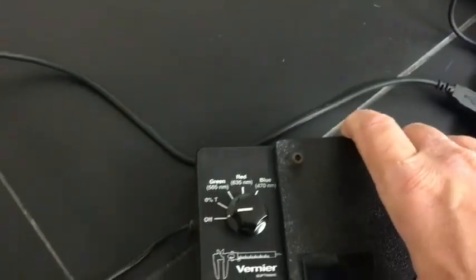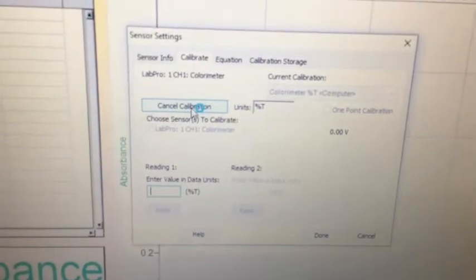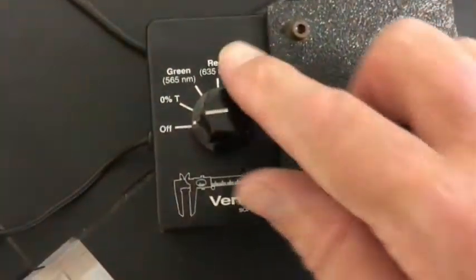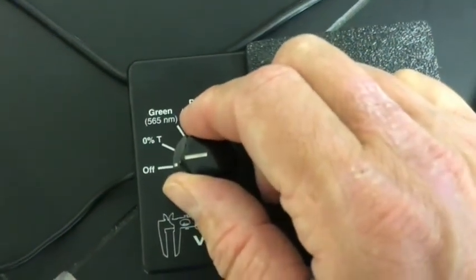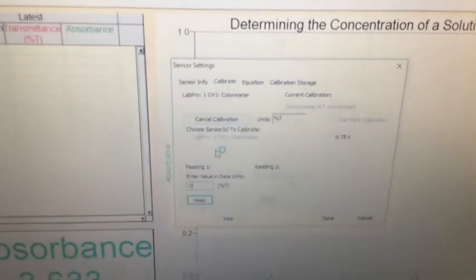Now close the colorimeter so no room light gets in. We have to tell it two different calibration points: zero and 100. For the zero point, set the knob to zero. The software will ask what value that reading is — it's zero. So type in zero and click Keep.